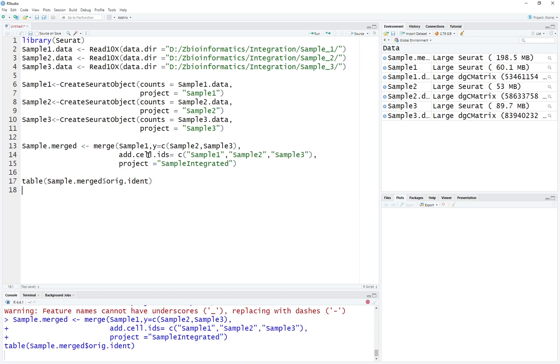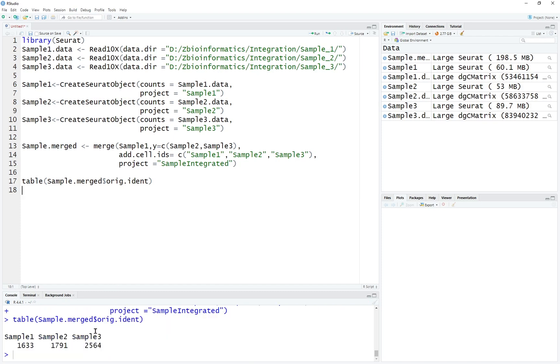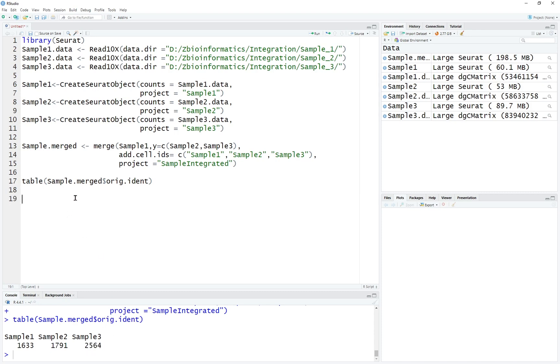After doing that, we're going to merge it and check the table. Now we have 1,600 cells from sample 1, 1,700 from sample 2, and 2,500 from sample 3. This is all the data, but we want to do the integration. Let's first visualize what the data looks like if we don't do any kind of integration.